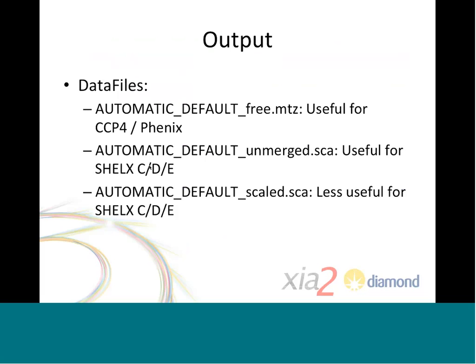There's also a merged scale pack file, that used to be useful for lots of other programs. These days it is not particularly useful, but I haven't gotten around to removing it yet.